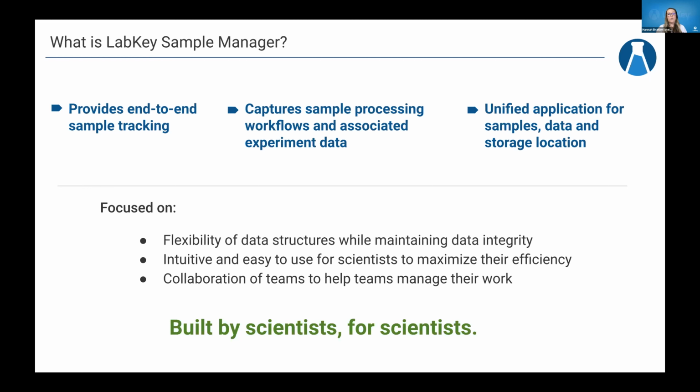And finally, really focusing on the collaboration of teams. You know, science isn't happening in a vacuum. So we want to make sure that we're capturing that collaborative nature, trying to remove your teams from emails and shared spreadsheets and things like that, and really give them a place to manage their work.